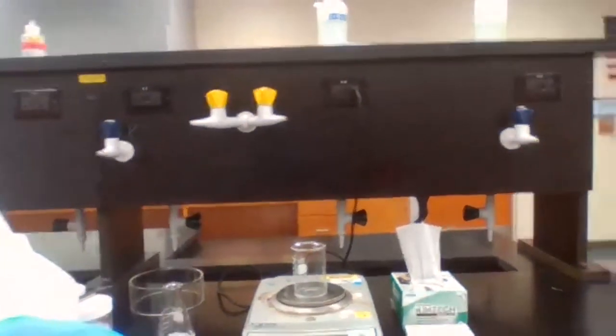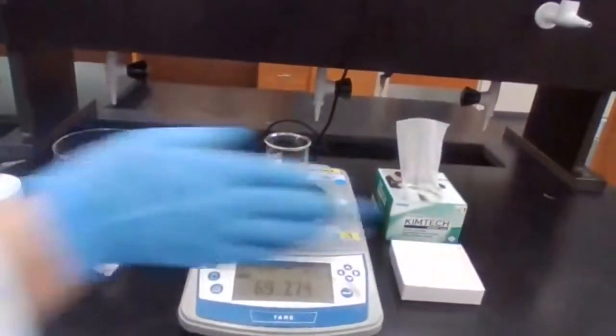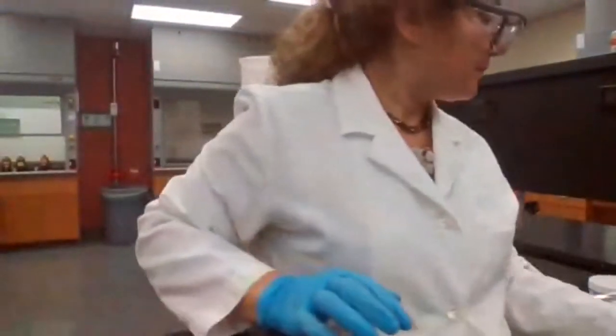Because it's very sensitive. When the AC is on, I'm going to show you, if I fan my hand around this, this number is going to change even more, like this. It's not the mass that is changing, it's the pressure over the balance that is changing. So you have that number.